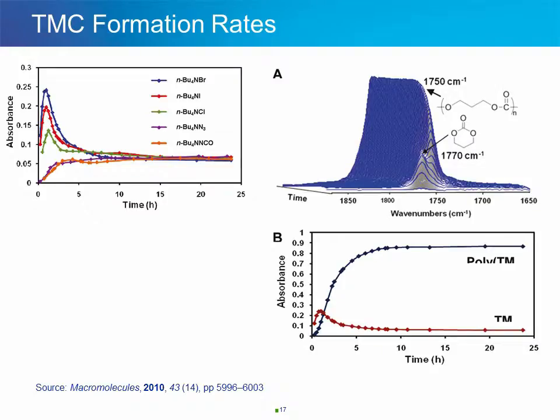They noted that the product distributions for the copolymerization reactions were determined by proton NMR spectroscopy. In all cases, good to high activity for copolymer formation was obtained, and the percentages of poly-TMC were found to be greater than or equal to 98%, with trace quantities of TMC detected after 24 hours of reaction. Consistent with the in situ infrared data, these results strongly suggest that there is an equilibrium process between the cyclic carbonate and the polycarbonate, as the percentage of poly-TMC did not reach 100% even after a 24-hour reaction period.